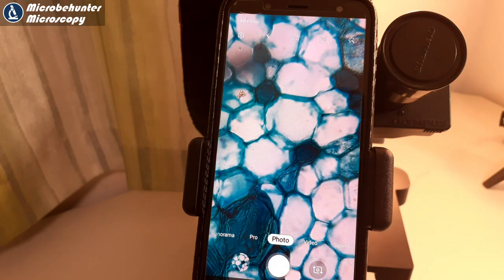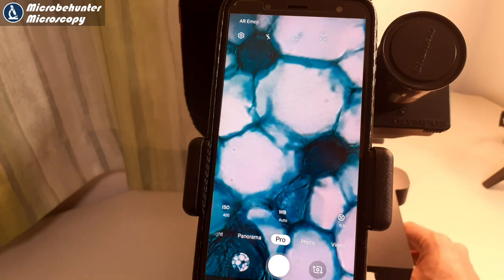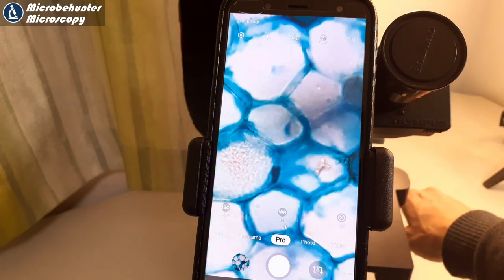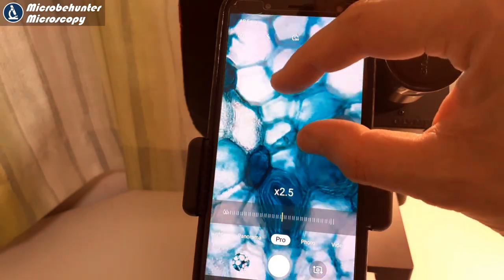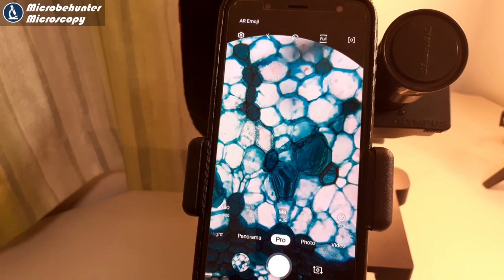You can simply take a picture by pressing here. Generally I would say that mobile phone adapters are the easiest and least complicated low-cost solution, and they have the advantage that you really see the picture as you see it through the eyepiece - you get a very large field of view, which can be an advantage sometimes. However, if you want to get high quality images of only a small partial area, then dedicated camera systems are probably the better option, because right now I'm using digital zoom which means you lose resolution.